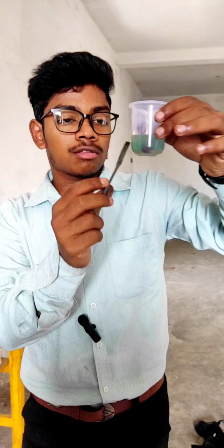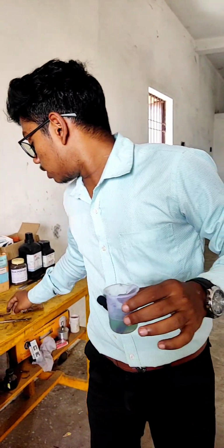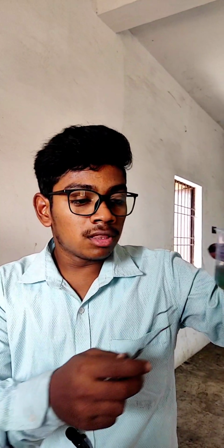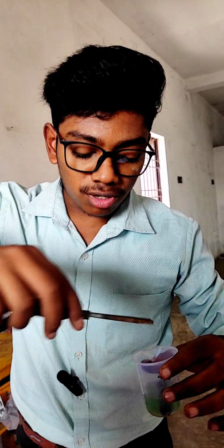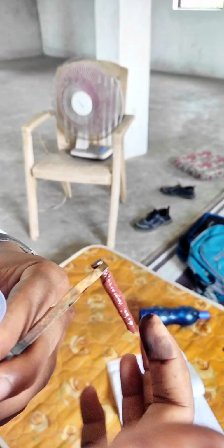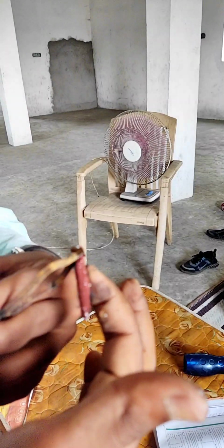The solution was copper sulphate solution, and we added 2 iron nails, and now we can see the iron nail displaces the copper in copper sulphate solution and forms ferrous sulphate solution. The green and yellowish color in the solution shows that iron has displaced copper from the copper sulphate solution, and the copper is deposited over the iron nail. The brownish part that is deposited over the iron is nothing but our copper.